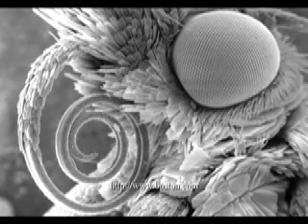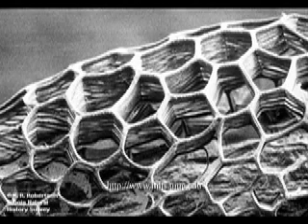The scanning electron microscope is a vital tool in modern forensics and is used for the analysis of evidence such as fibers, paint, and fingerprints. The scanning electron microscope also plays a role in biology and has been vital in analyzing the physical characteristics of insects that are far too small to see with the naked eye. But the applications of the scanning electron microscope do not end there. This tool has much potential and can be applied to many other fields of science, helping researchers make new discoveries.